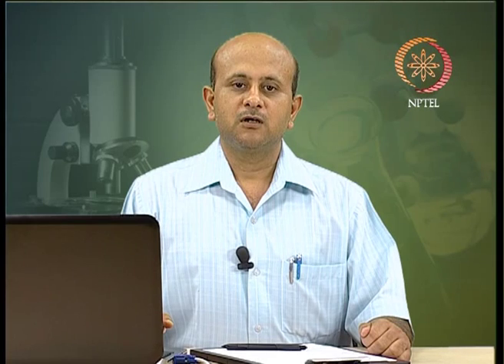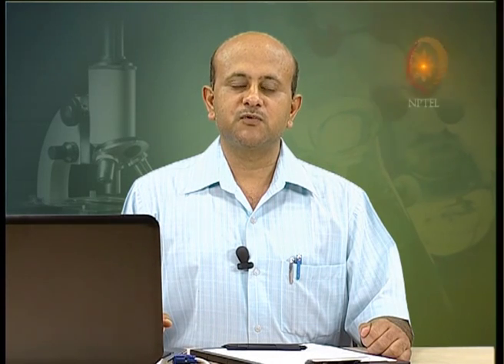Whichever material needs to be spun is placed in a centrifuge tube, which is then placed in a rotor. Now, the rotor, and I have shown you this in earlier lectures also, is generally a dense metal which can dissipate heat and take the stress of centrifugal force. It has sufficient mass that it can generate momentum, and it can spin without any problem.